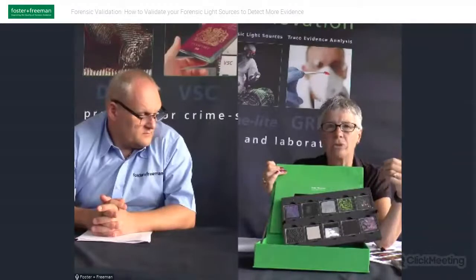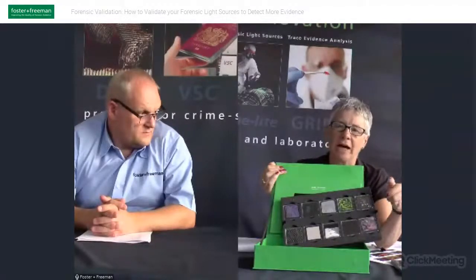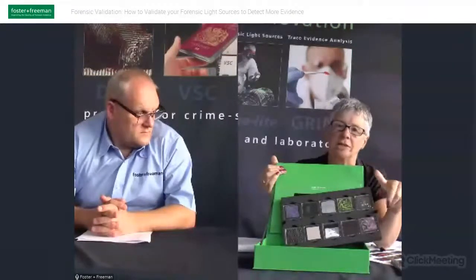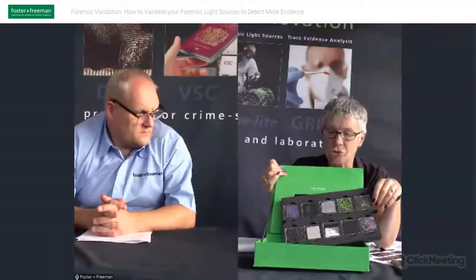And also when we're doing online training, you have the same kit as we do. And it's very easy to say, take sample A or sample B, and we'll look at that, and this is what you should see. And the images of all the samples under the different light sources are provided with the kit. So you get a copy of that with your own personal kit to demonstrate what you should be able to see. But when we're delivering training, especially online, it's very helpful to use this kit.